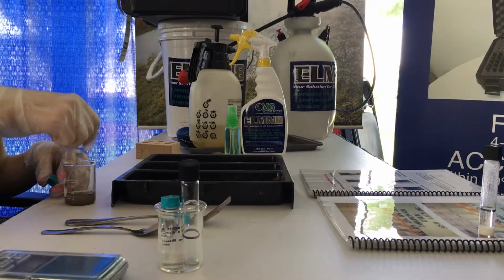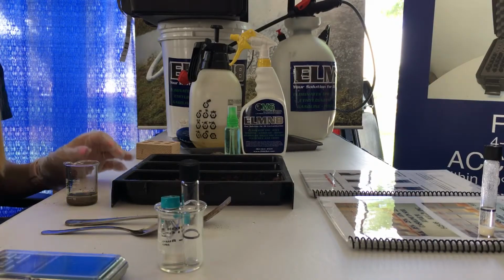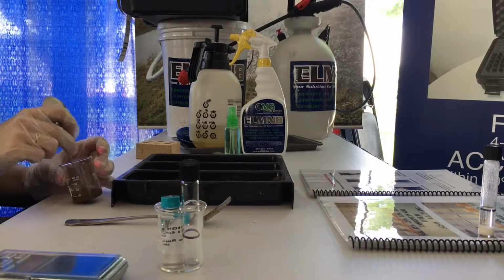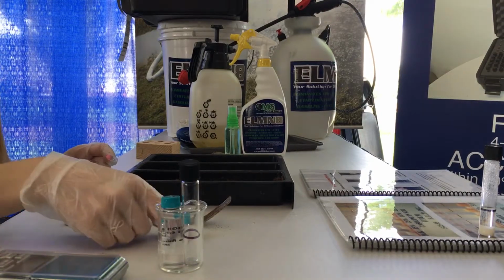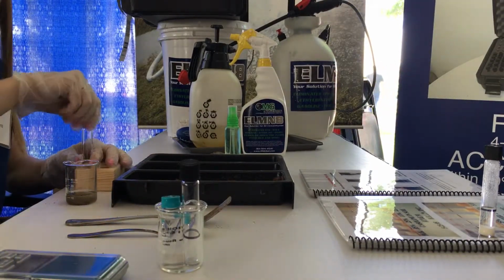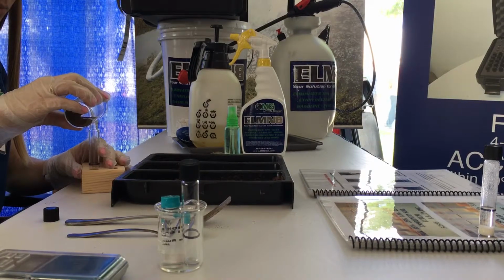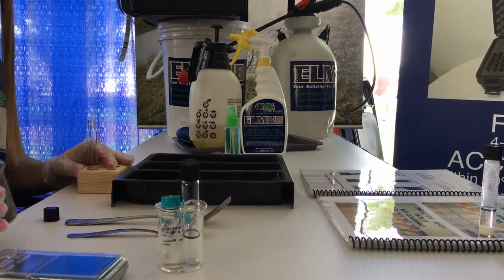By the way, there's 10 mils of solvent in there. There's excess solvent, because when you pour into the scribe line on the test tube, it's only 4.2 mils. There's excess solvent for a purpose. In the event that your result was very, very dark, way off scale, you could pull the 10 mil graduated cylinder that's included in your kit out, go back to that original extract, pour 1 mil in there, and go all the way up to a 10-to-1 dilution to bring it in range and to quantify what that number is if it's off scale.